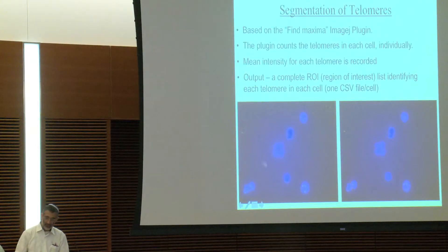Okay, so now we have to segment the telomeres, and again, I don't know if you can see it closely here, but I've marked the telomeres that we found in red. We use the find maxima function in the process menu to find the telomeres after some preprocessing, and then we count them.